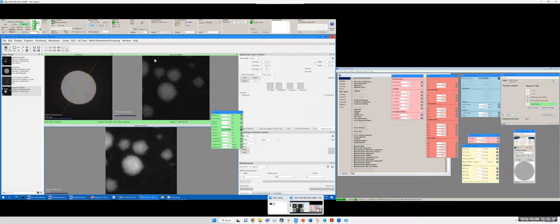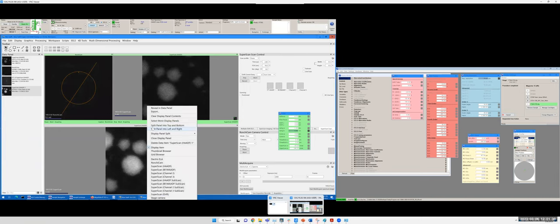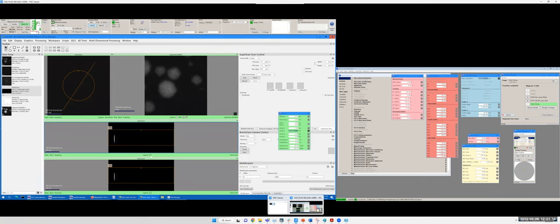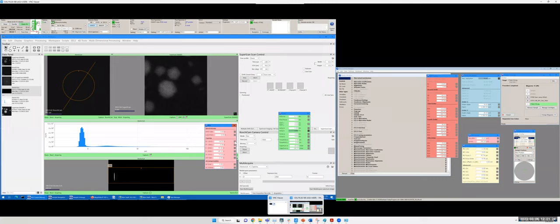Now I want to simply introduce EELS. So we click EELS and change the mode into EELS. You can see the CCD is not showing the camera anymore. I want to split the bottom region into top and bottom and show the EELS camera, and click play. Normally you will see something, and you click capture, it will show the spectra. This is the image on the CCD, and this is integrating vertically. So this is the basic alignment pattern for EELS.